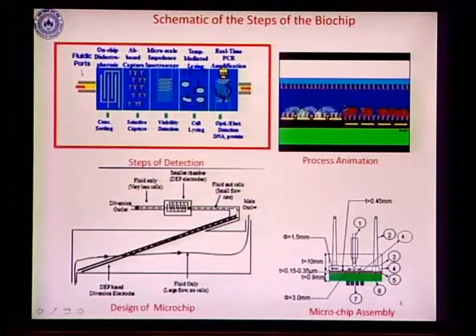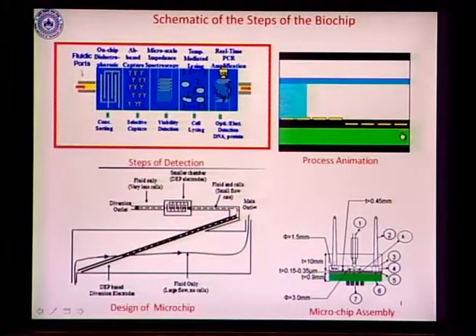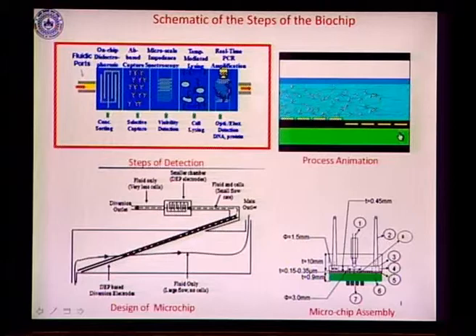you can see that the bacteria has grown many folds, as you can see here, right. And as they grow, the impedance is sensed, and there is a trace or change or indication of the impedance which would determine what cell types you are flowing in inside this particular chip. And then this process is followed by the on chip lysing and the PCR process, all within the same microchip.